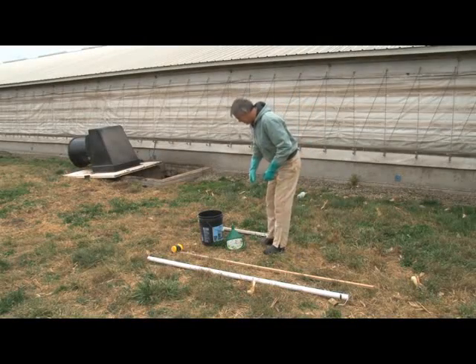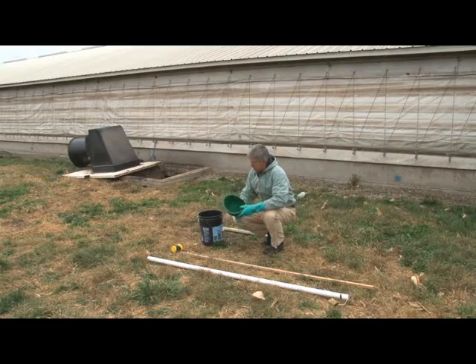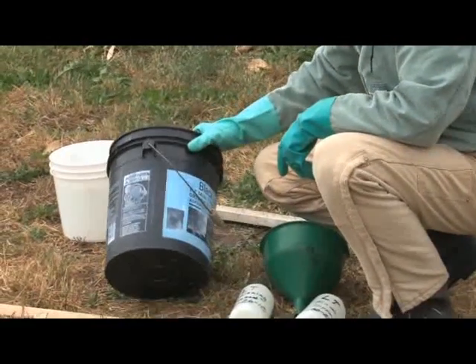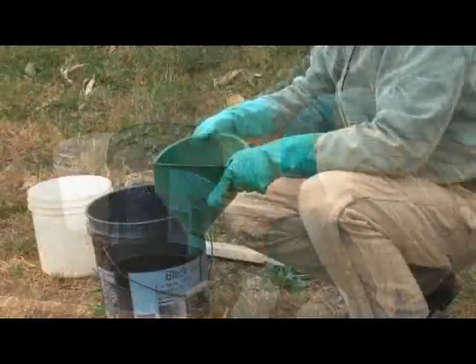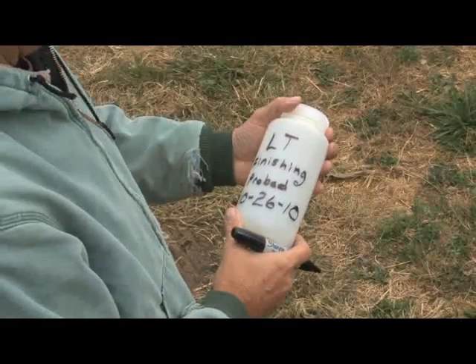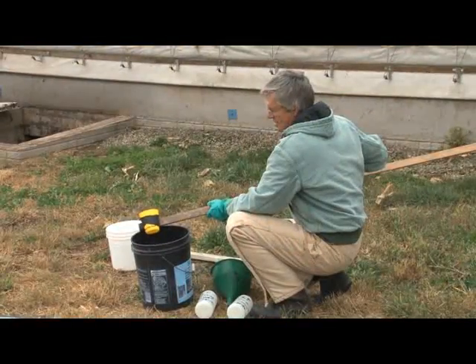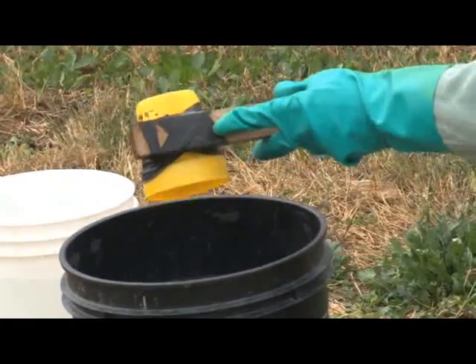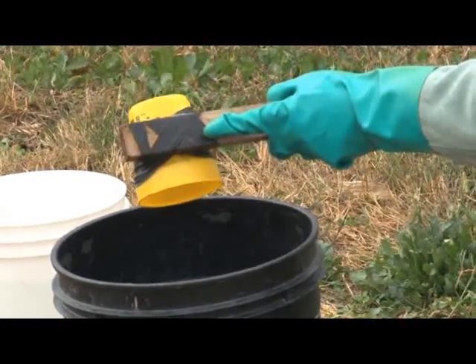A few pieces of equipment are needed for manure sampling. First, rubber gloves to protect yourself, a bucket to mix the subsamples from different locations in the pit, a funnel to pour the final mixed sample into, the labeled sample bottle, and a dip sampler. This sampler was made using a long piece of 1x2 and a cup securely taped to the end.